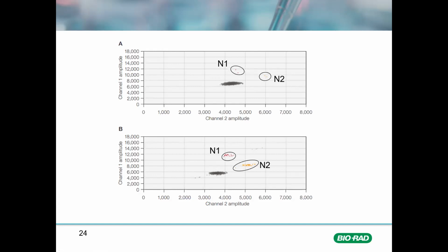However, because ddPCR is such a precise measurement, even with only 4 droplets, we are able to identify with high accuracy and high confidence the presence of the virus in the sample. And then B would be another example that just has a slightly higher concentration, which is just giving us more positive droplets. But even in this case, we don't have RP, we don't have dual positives, and we don't have triple positive populations, but that is okay. All we have to do is identify one or the other.